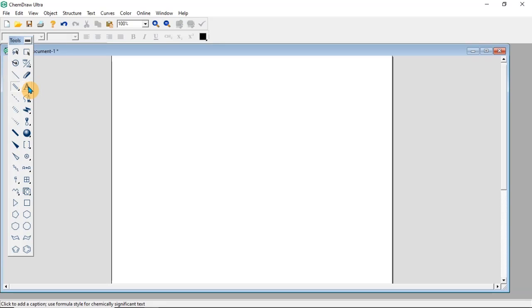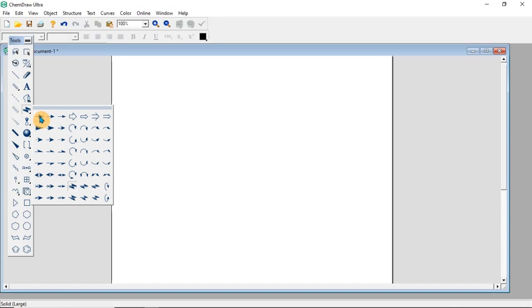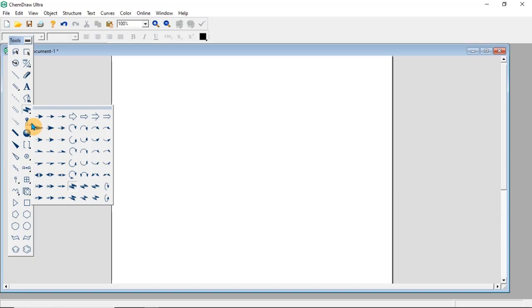We have the text button. If you click on that, you are going to add text to your document. We have an eraser, which is used to erase a particular drawn element. We have the arrow tool, which comes in different forms — there are many types of arrows, including the resonance arrow and others. If you click on the one you want to use, then drag, it will appear.